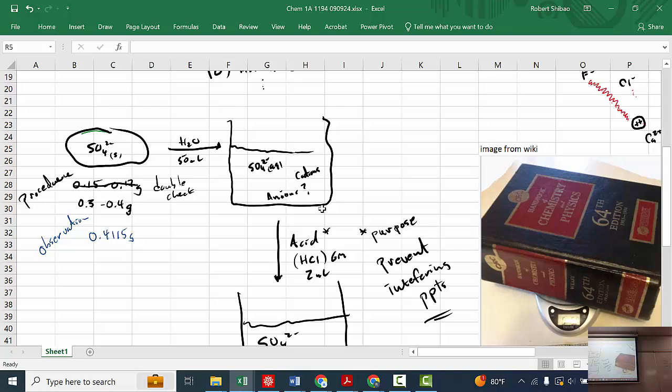So you're going to get something like this in a beaker, like this, and a tray. This is going to be too hot to touch. And we have something called beaker tongs. Let me show you what beaker tongs look like. We have a box of beaker tongs over there. And so you can grab a pair of beaker tongs. And beaker tongs are meant for gripping beakers, so we can hold the beakers quite easily with beaker tongs.